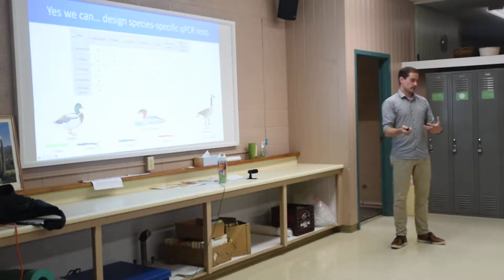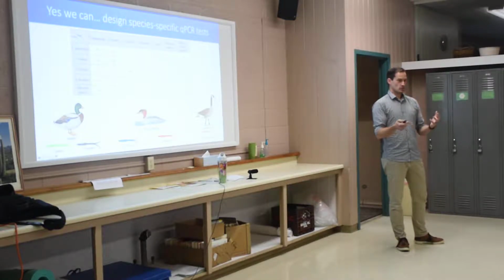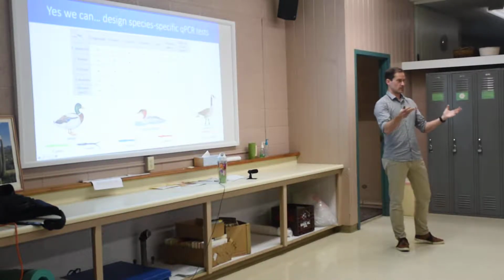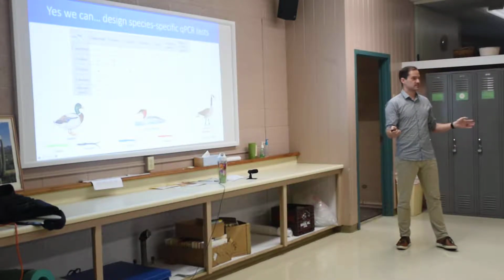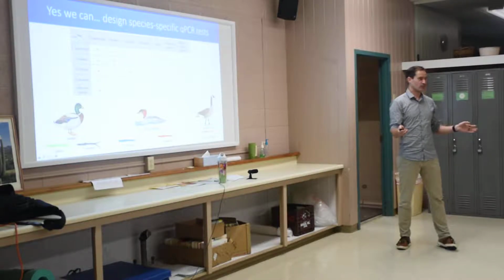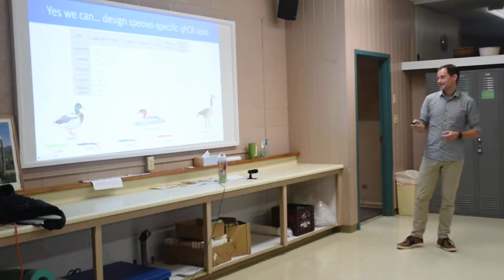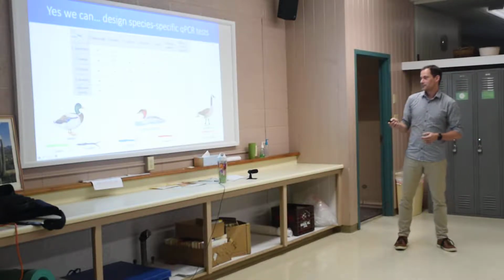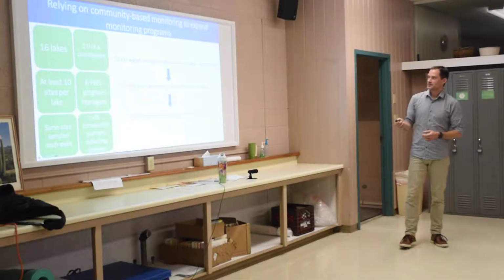And now this year, we took those tests and we said, well, let's see what we can get with this. So Ron and Freshwater Solutions, with a bunch of you guys, I'm sure, put together what I think is pretty much the biggest community-based monitoring program for water sampling testing, certainly for swimmer's itch in the world. And it's a very comprehensive testing program. So this is what it looks like.